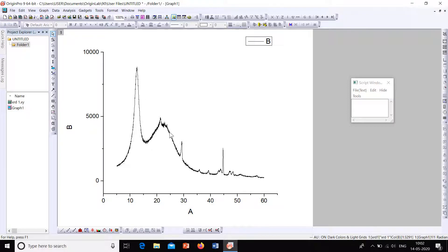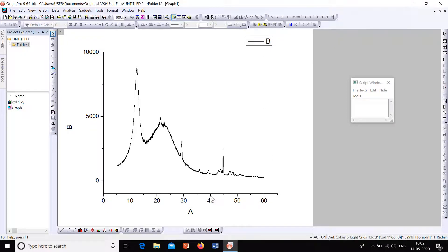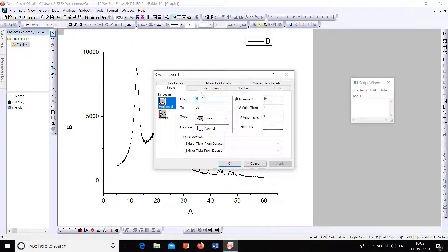This graph doesn't look nice — we cannot submit it to any publication as is. We can modify it into standard form. First of all, we have to close this box. Here only the X and Y axis is shown, so we have to close it at the top and at the right corner. Double-click on the axis to get the dialog box.